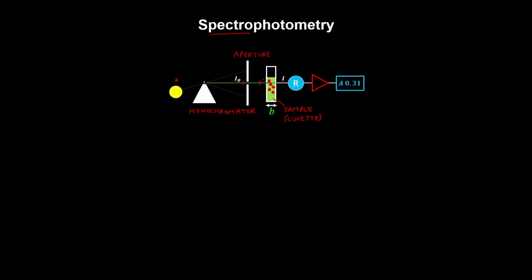Now fractions of the incident wavelengths of light are transmitted and reflected from the sample, and a photodetector, which is the photometry component of the experiment, compares the relative intensity of two beams of light. So you run the experiment once using a reference sample for comparison, and then you run your experiment using your regular sample.